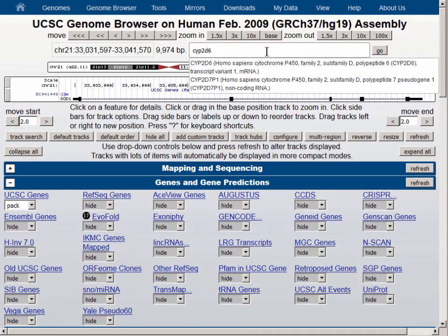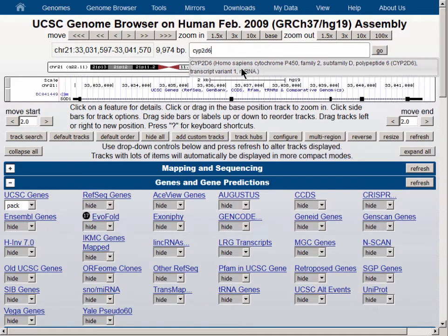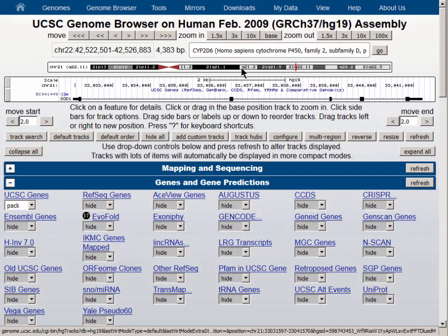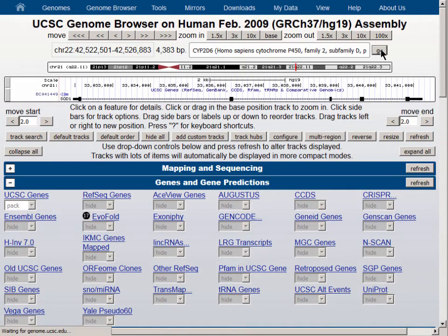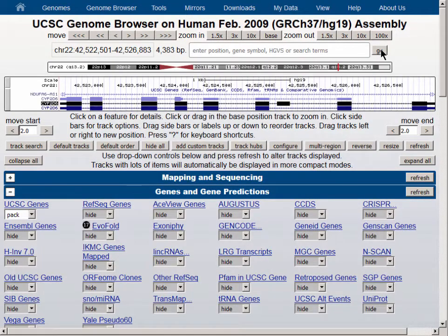Let's go to a different gene location which has multiple isoforms — the CYP2D6 gene — and we'll see how the visibility settings affect the display under various scenarios. You can see here that there are three isoforms of this gene and an antisense transcript from another gene from a nearby location. We're at Pack visibility.